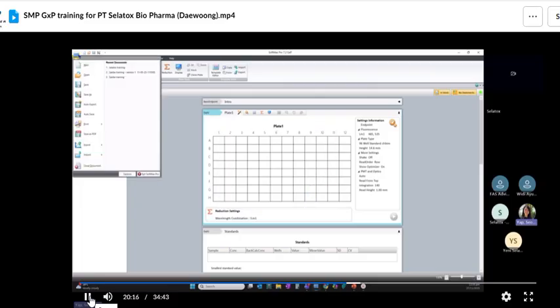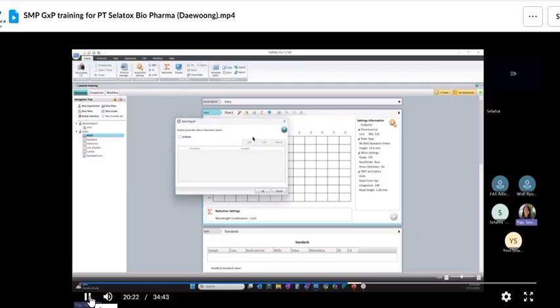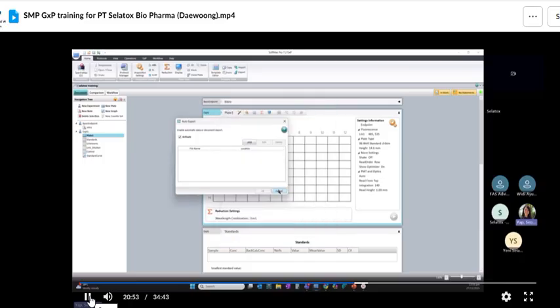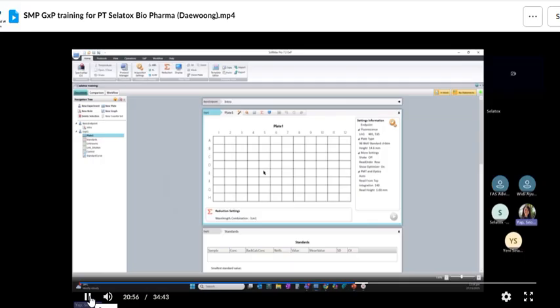So you can auto save, as well as turn on auto export. Auto export means exporting to external. If you have a LIMS system or SDMS system you want to integrate, you can activate this and then add a path assigned to a folder outside. Then give a name. Export in what format? Let's say you want to export in XML, signed XML. Go ahead and turn it on, and then create a folder name or whatever. It will auto save to an external folder so that you can do a backup or integration. But for now, I will skip that.